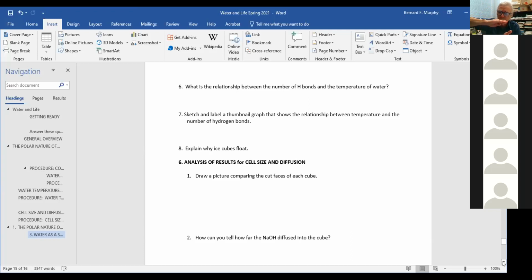That volume of water in the tubes that have a larger diameter is smaller and squatter. But in smaller ones, the same volume is squeezed, so it's taller and taller, narrower and narrower. It's the same volume of water. So how is this biologically relevant?